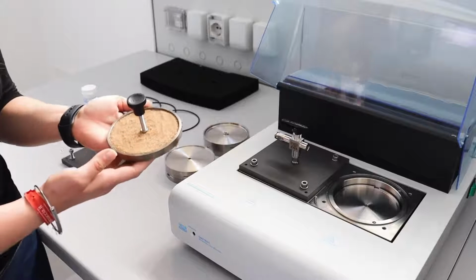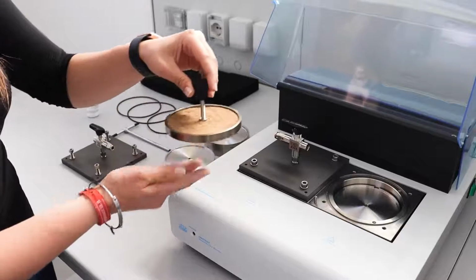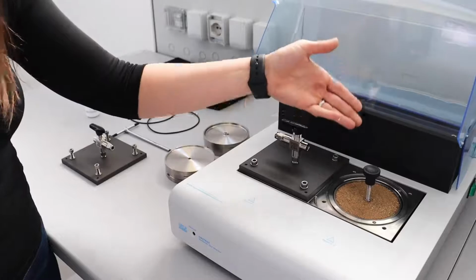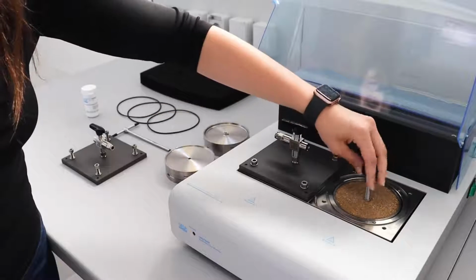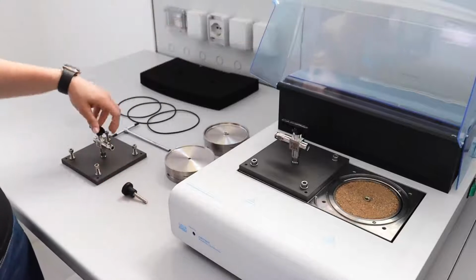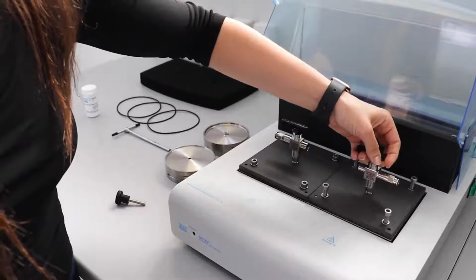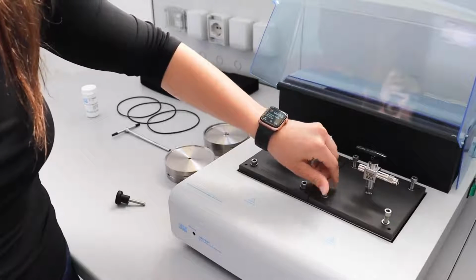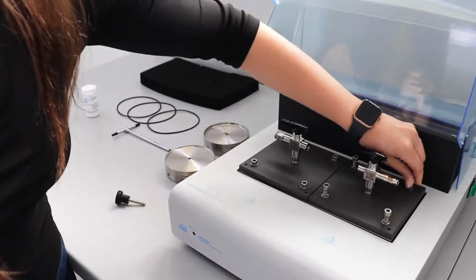It's grinded and perfectly homogenized, and I can simply place it with two spacers inside the titanium heating chamber. Then I place the closing, I start securing it, and I complete the process.